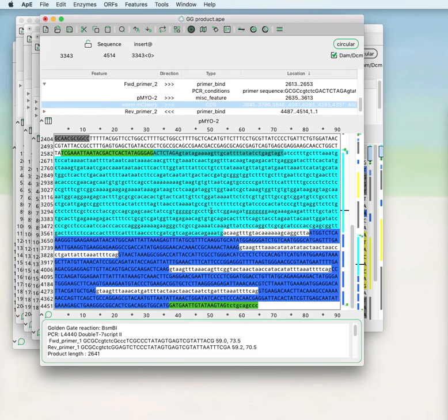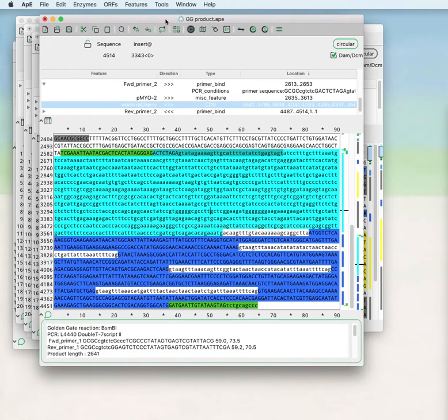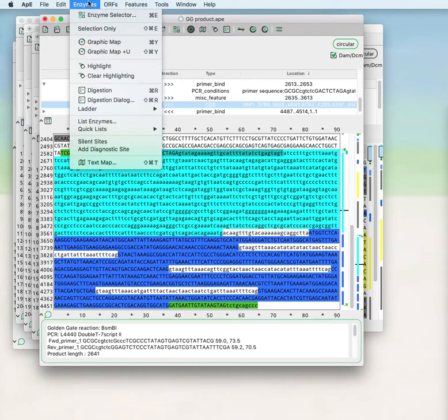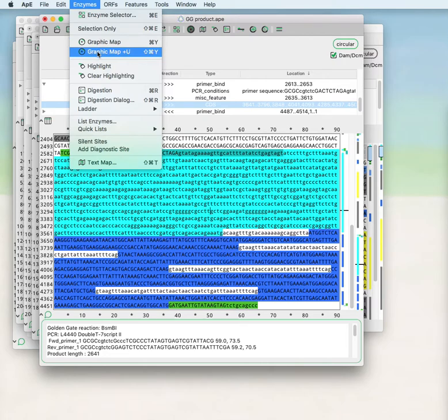Welcome to the APE tutorial video series number 11. This video will show the graphic map. The graphic map is available from the toolbar with this icon or from Enzymes graphic map or graphic map plus U.